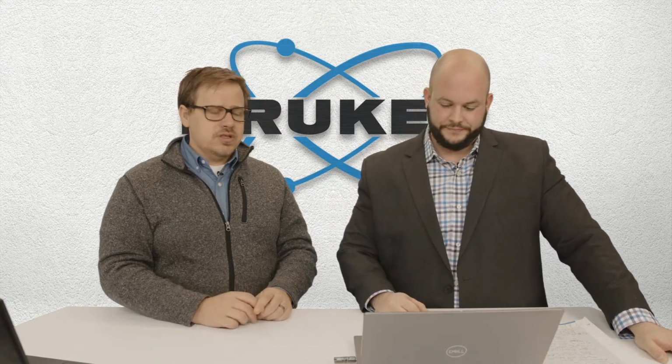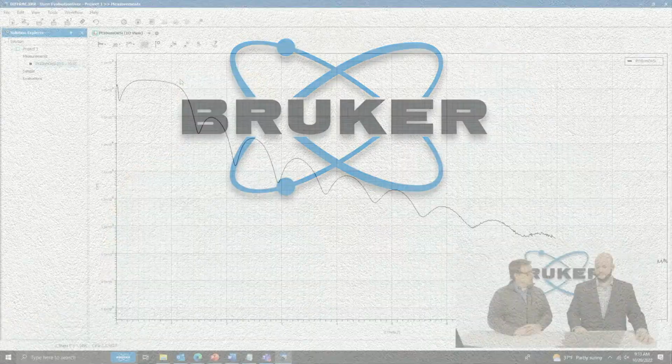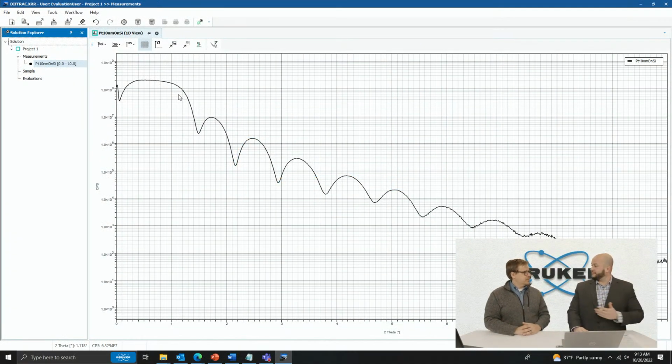One other thing I wanted to note here is that the critical edge, that initial drop, is actually important too. That's basically going to determine the density, or the density determines the critical edge. So that's the density of the top layer. That's correct.